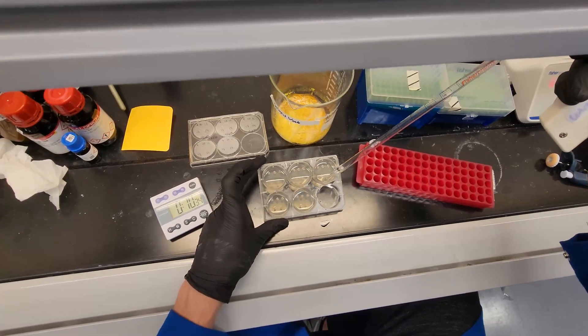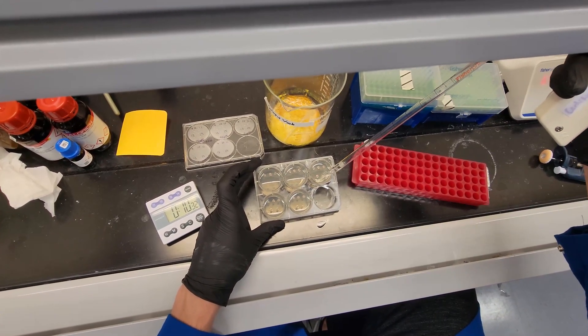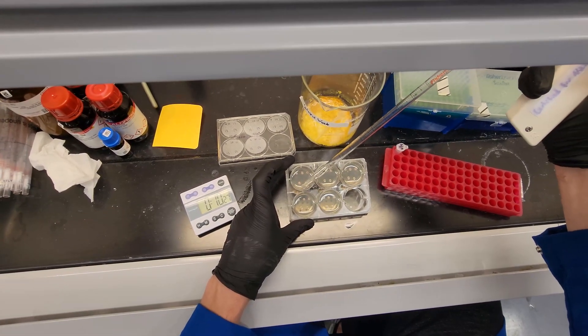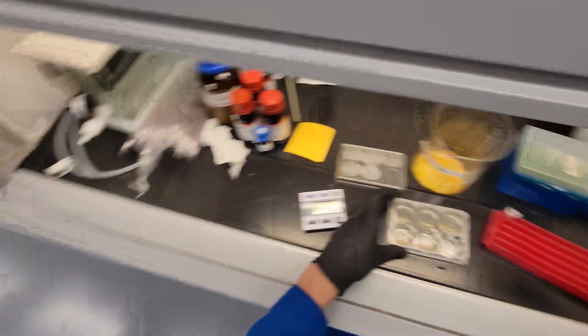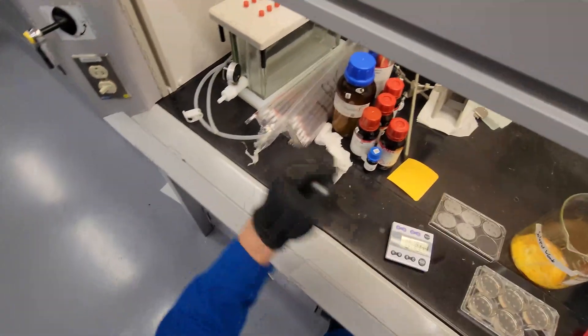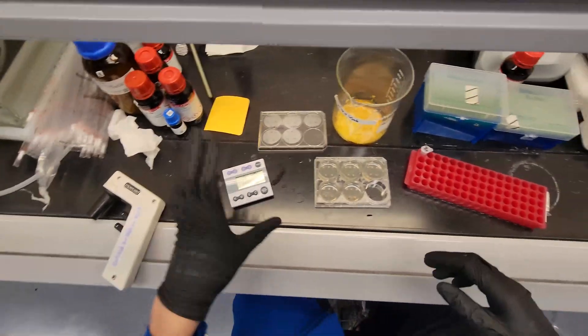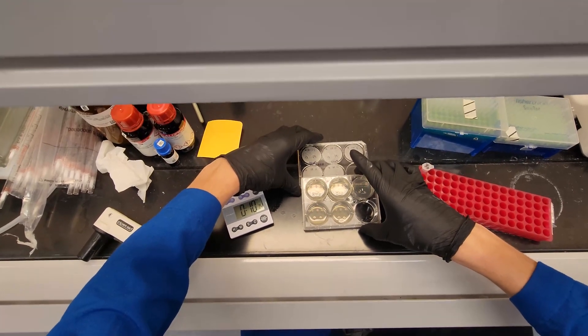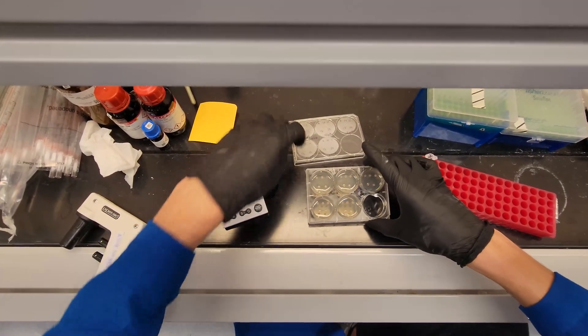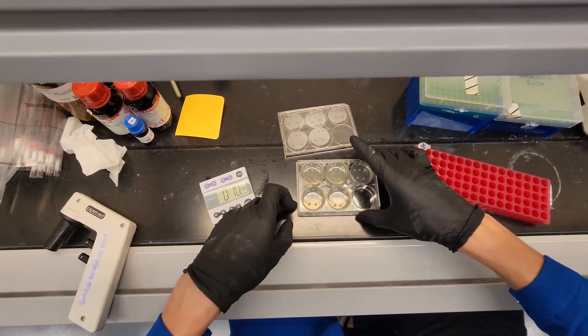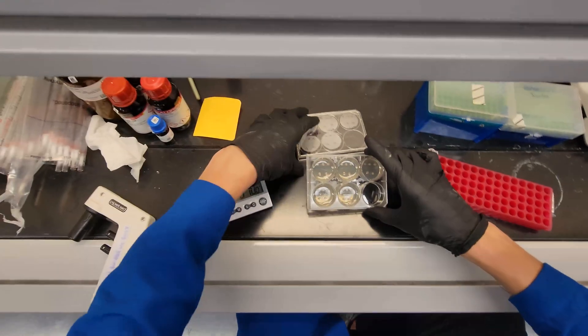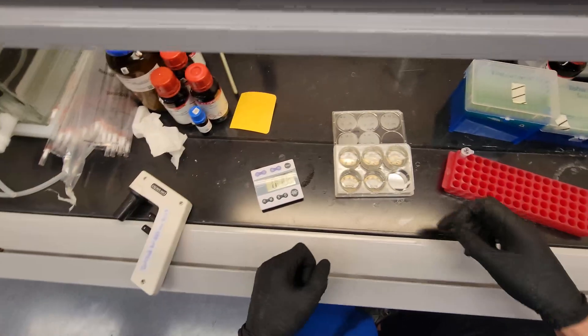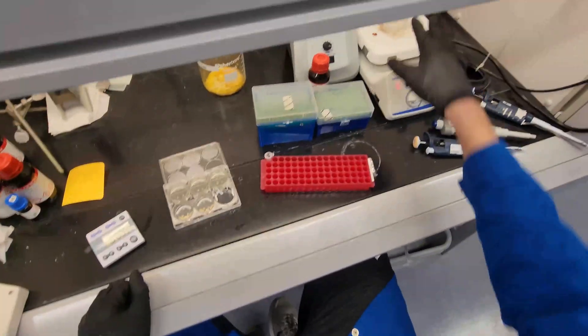We'll start a new timer for 10 minutes. So, if you're doing a lot of these plates, you can just go like this. You just don't want to suck up chloroform into the pipet gun because it will ruin it. All right. That's it. That's easy. We'll leave this in the fume hood because it has chloroform on it. This can go away. And I also like to prop - actually, it's fine. Sometimes the chloroform can pool on some of the colonies. Yeah. We'll prop it up.